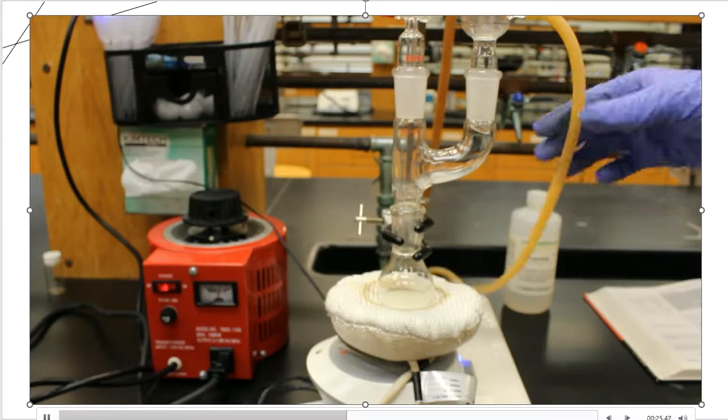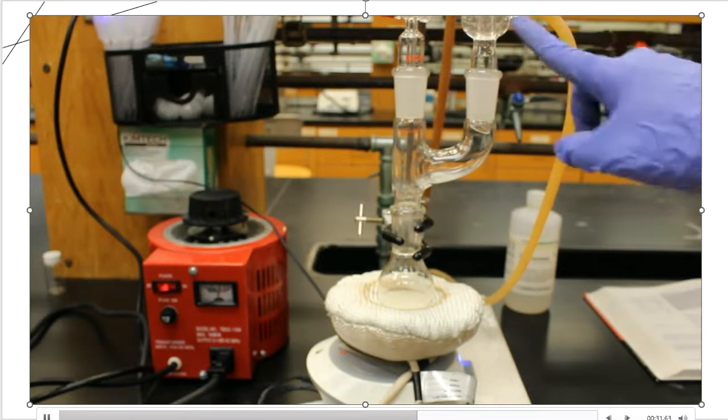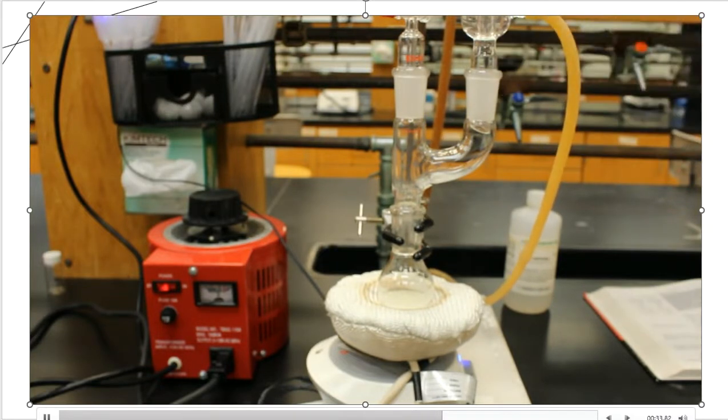I need to turn the water on in order for that to kind of do its thing. So I'm going to turn the water on very slowly, and you'll start to see water begin to fill up my condenser, so that way it will get cold and it will stay cold for when I need it. All right, so we're just going to let this kind of hang out, do its thing, and then we'll come back to it after 30 minutes like the procedure tells us to do.